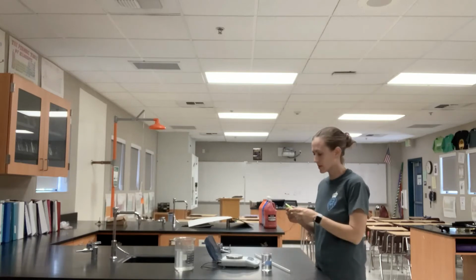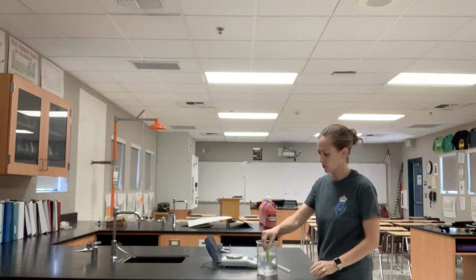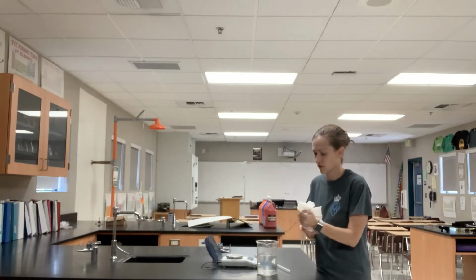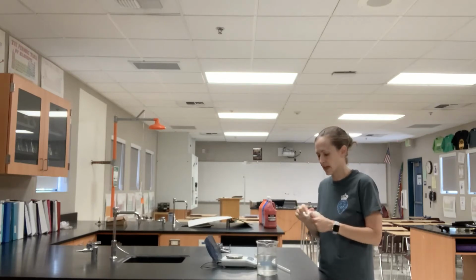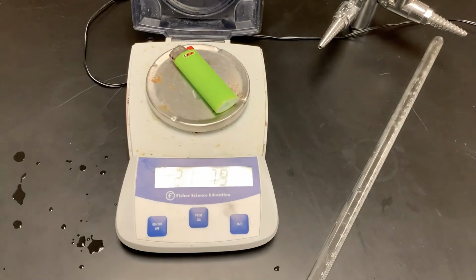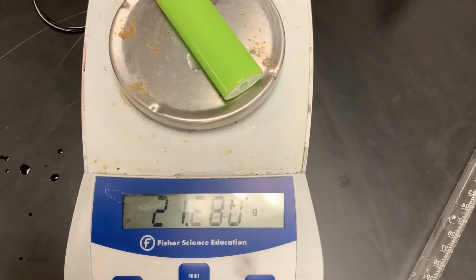All right, the first thing I'm going to do is take my lighter and put it into water. The reason I do that is I want to get it nice and wet, just like it's going to be after I'm done expelling gas from the lighter itself. Then I'm going to grab a paper towel, dry it off, shake it out, make sure it is as dry as I can possibly get it, and weigh it on the scale. Now I need to make sure to zero the scale. And this is the mass I get of my lighter before I expel any gas.